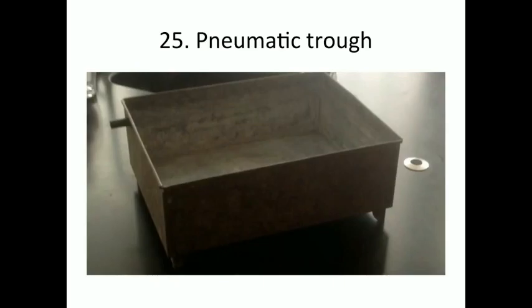This is a pneumatic trough. We use this to help us collect gas by water displacement. It's also used for making ice baths or hot water baths. Ice baths will slow down a chemical reaction. Hot water baths will accelerate reactions.